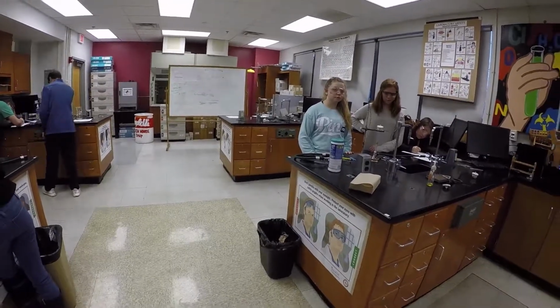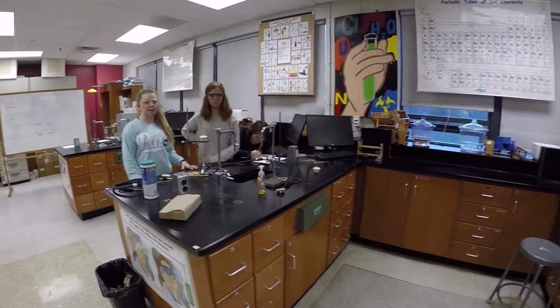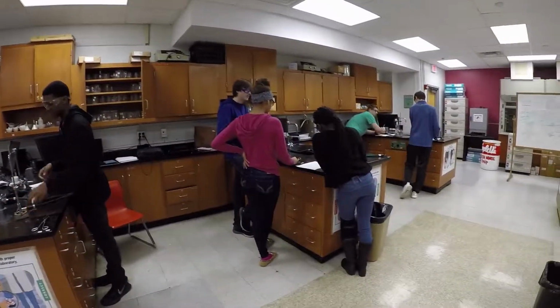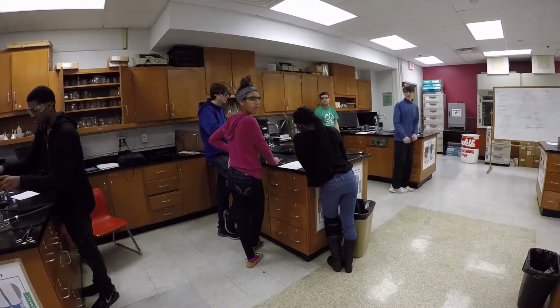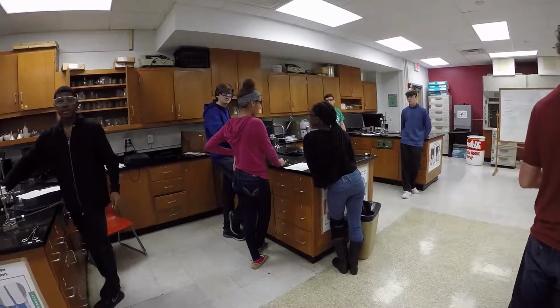Do we put the lid on? So it'll catch on fire. When you take the lid off, do you turn off the gas? No, keep the gas on. When you take the lid off, what should you not do, Ryan? Use your hands. No. What should you not do when you take the lid off? Turn the gas on. Look directly at what?